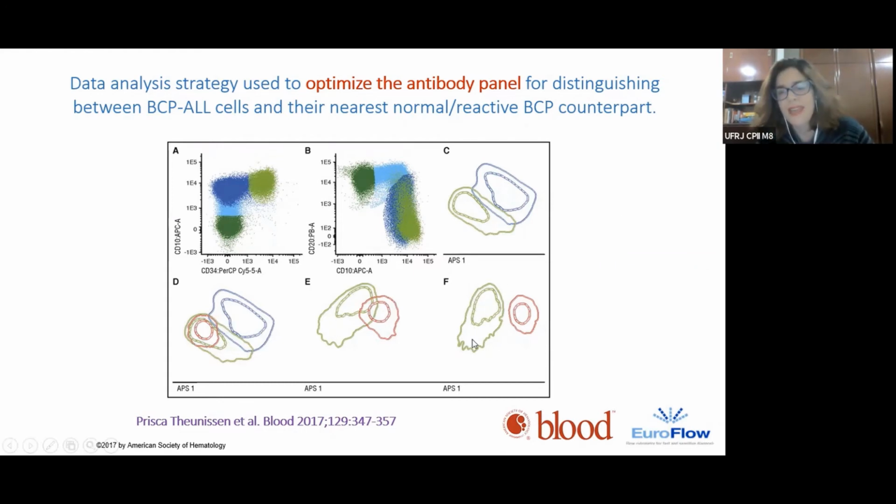So we can have, for instance, a situation like this. That's an ideal situation. It's completely split. The two populations are completely different. And we can have a worse case where the two populations are superposed within two standard deviations.